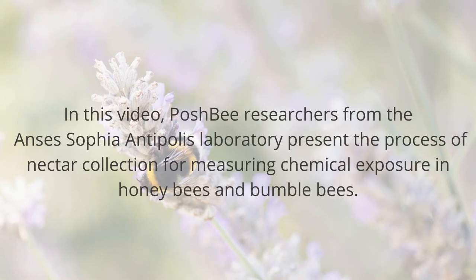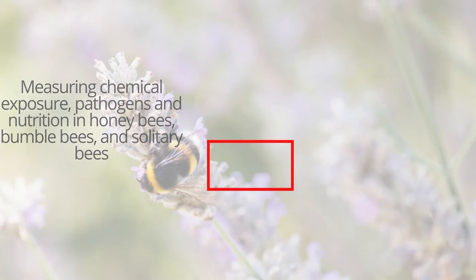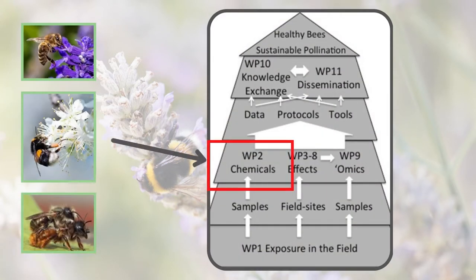In this video, PoshBee researchers from the ANSES Sophia Antipolis lab present the process of nectar collection for measuring chemical exposure in honeybees and bumblebees. PoshBee has many work packages. Here, we will concentrate only on work package 2, which involves measuring chemical exposure, pathogens, and nutrition in honeybees, bumblebees, and solitary bees.